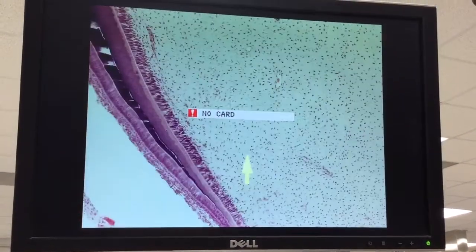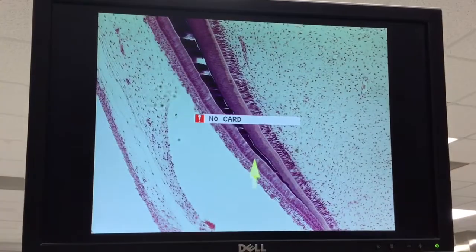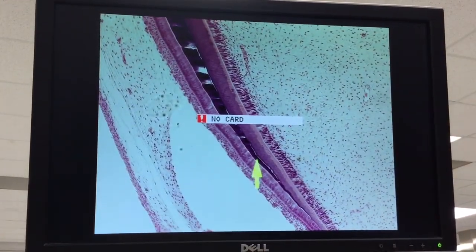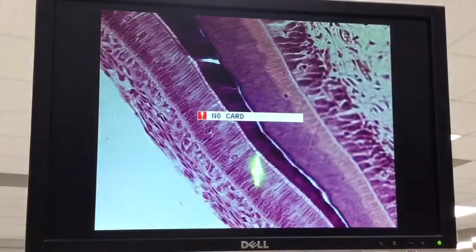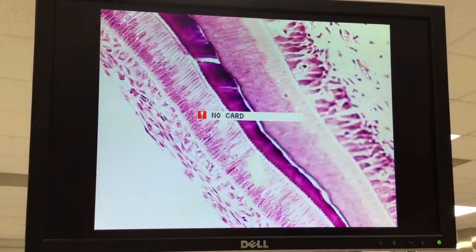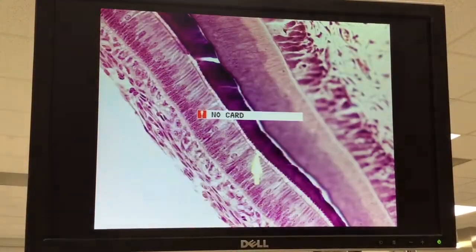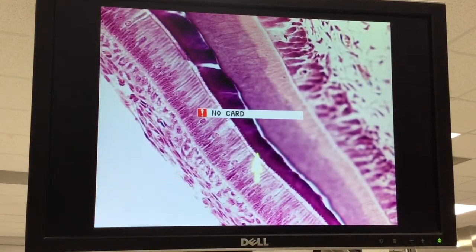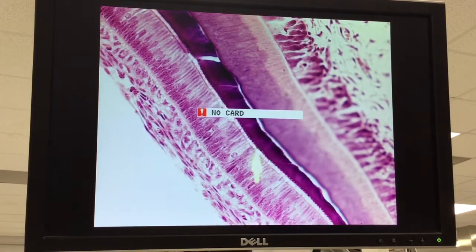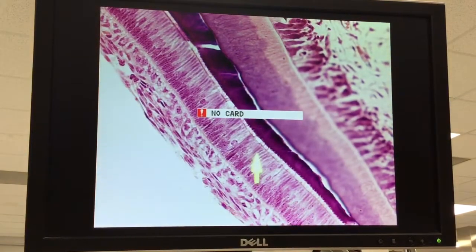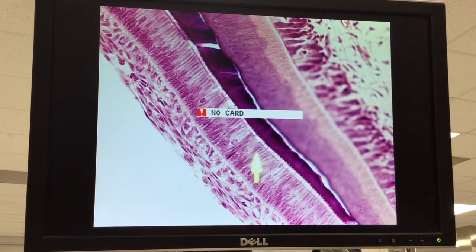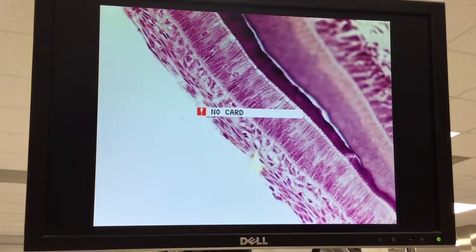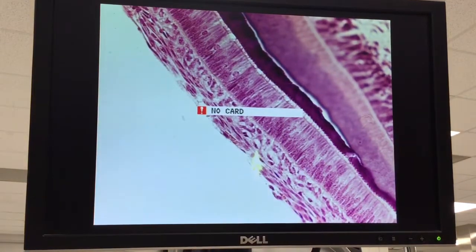Then we start to see the enamel proteins being laid down. If we take a closer look at this, we can see Tomes' processes. So there's the enamel. You can see little divots in the surface. There are the ameloblasts in the synthetic or the formative stage. And there is the outer enamel epithelium.